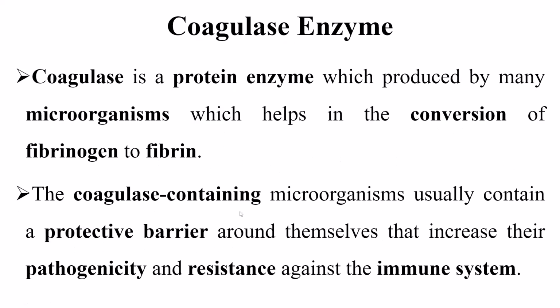Coagulase, as we said previously, is a protein enzyme produced by many microorganisms, which helps in the conversion of fibrinogen, a protein in our blood plasma, to fibrin. Those are proteins related to the clotting of the blood.